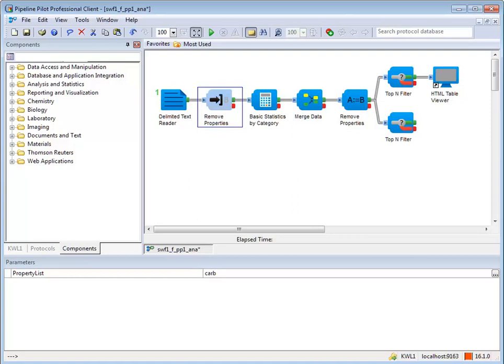In the Halt data state, data reaches the component and proceeds no further. The component does not operate on the data.